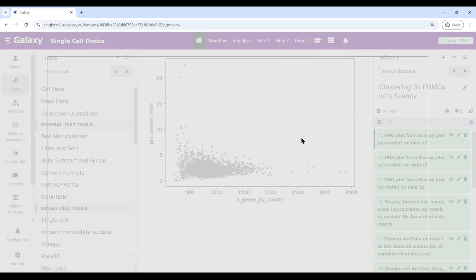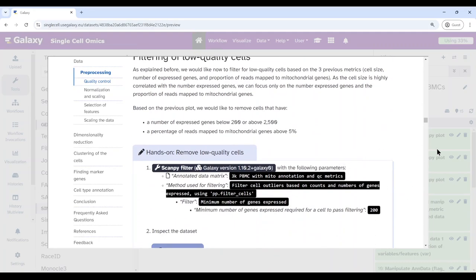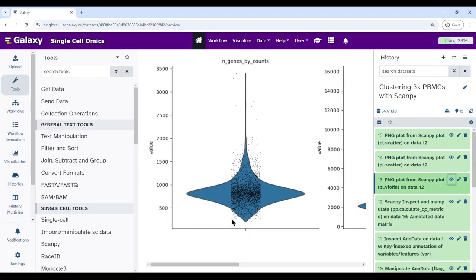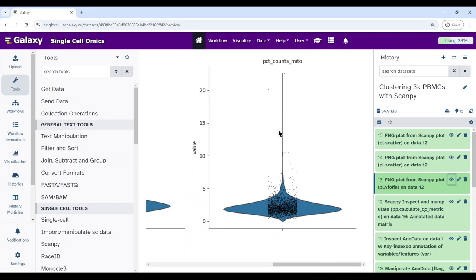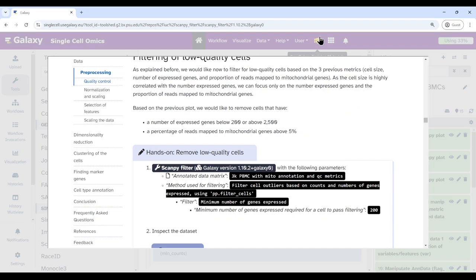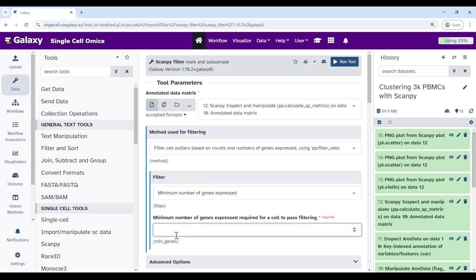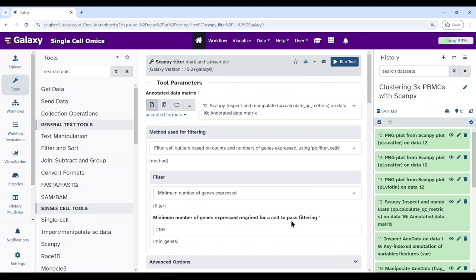Now we filter for low quality cells. From the plots, we put a cutoff: every cell with less than 200 expressed genes can be thrown away, and all cells with more than 5% mitochondrial content can also be removed. The first filter uses ScanPy Filter on cells with minimum number of genes expressed set to 200. Then run the tool.